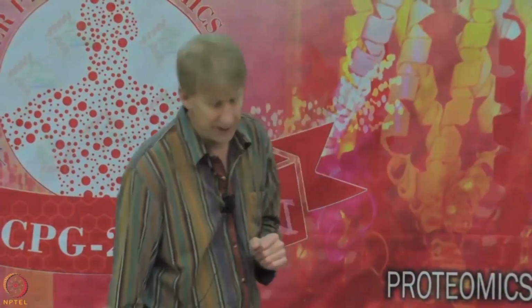Okay. All right, the mass spectrum right now is labeled B and Y, and we'll skip ahead to talk about that. All right. After this slide, we're almost never going to see elements again. We're always going to talk in terms of amino acids, and we'll use letter codes for amino acids.